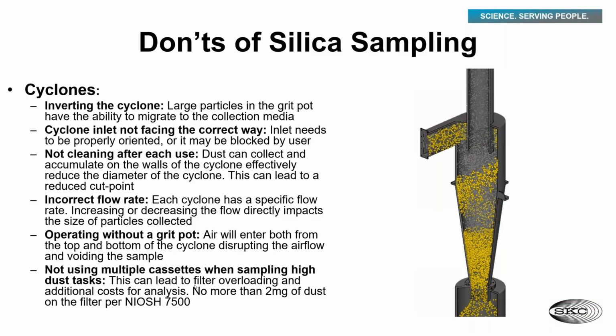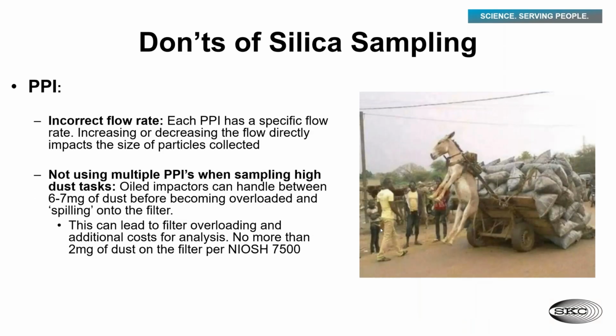There were certain times when we were sampling underground that we would change the filter every single hour throughout the day, so we could get a really good idea of what was really adding to his exposure. Was it task A, B, C, or D? Based on the sampling that we did, we could start narrowing in on which of those tasks is contributing the very most to his exposure. So try that sometime.